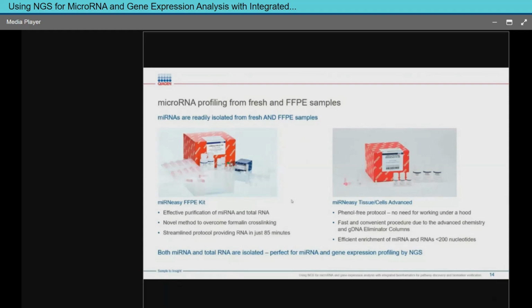So if you traditionally isolated something using a QIAGEN RNA kit, the cutoff of those kits is about 200 bases of RNA. If you tried using a different method, just make sure that if you go back to those samples, you have the microRNA there.